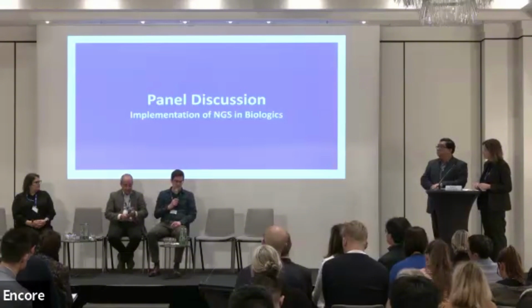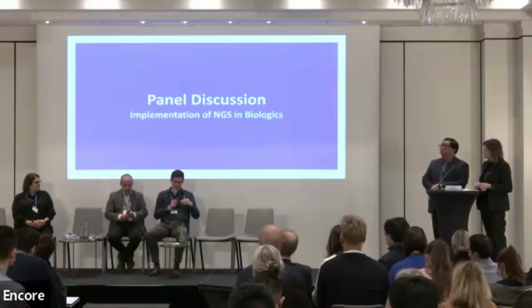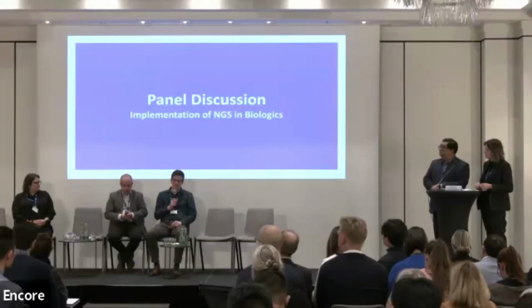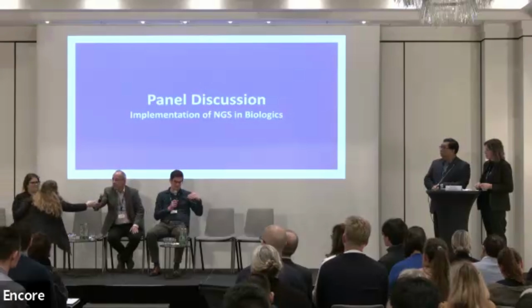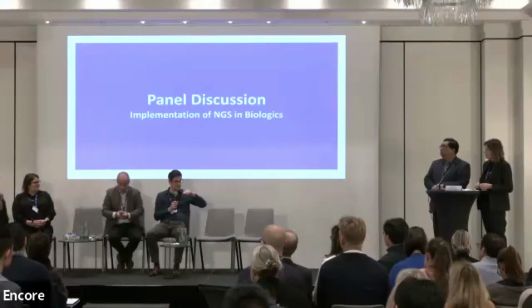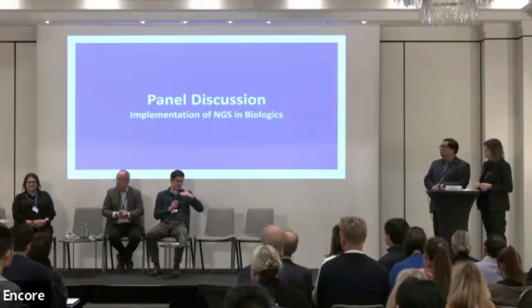Okay. Yeah, so you're basically right. So indeed, the first step is analyzing it with k-mers. And you're right, as I was saying, not always are, let's say there are a few reads that belong to Rio 1. And if it happens to be the case that none of the k-mers are specific for that particular strain, then indeed we sometimes see, as I was saying, genus or family or something like that.